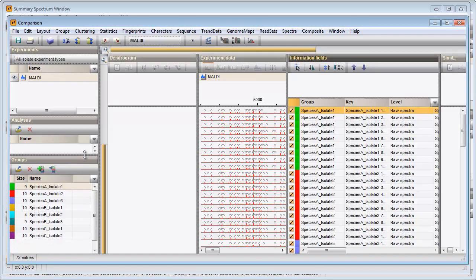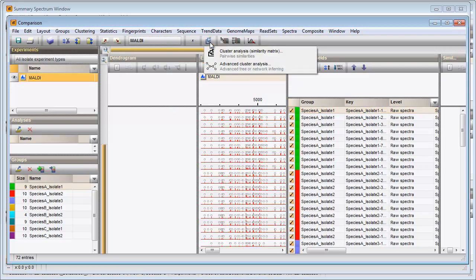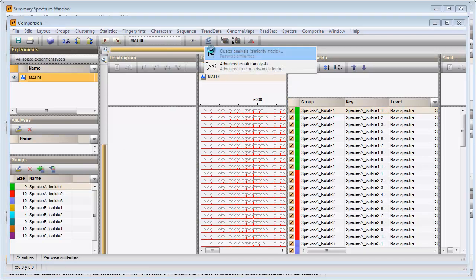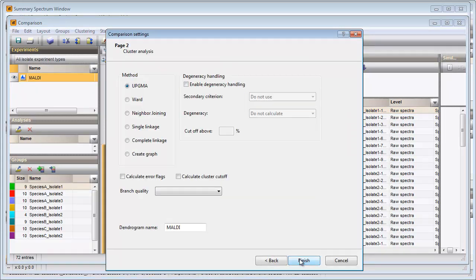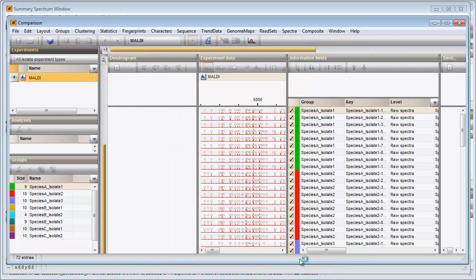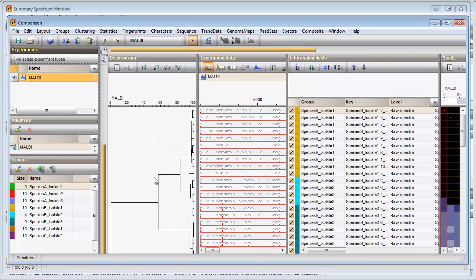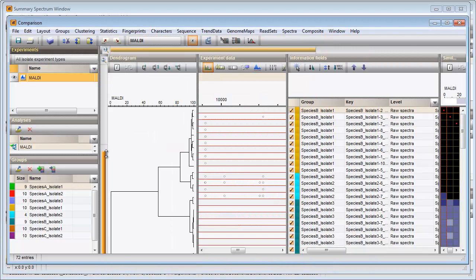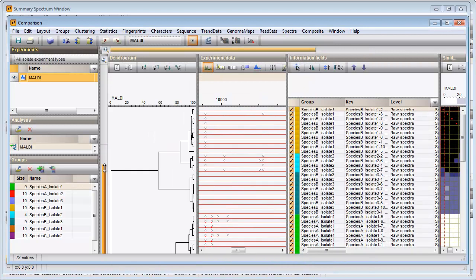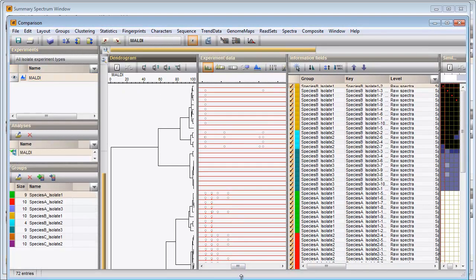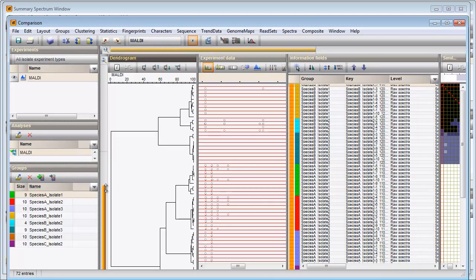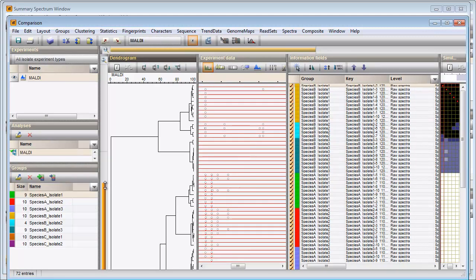I will let the software calculate the dendrogram using the Pearson correlation coefficient. The dendrogram is displayed in the dendrogram panel.